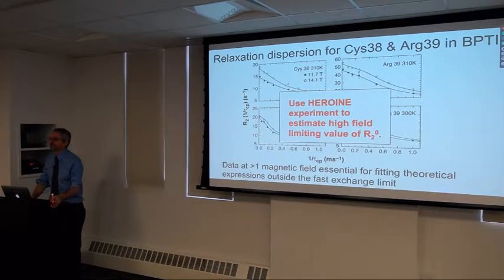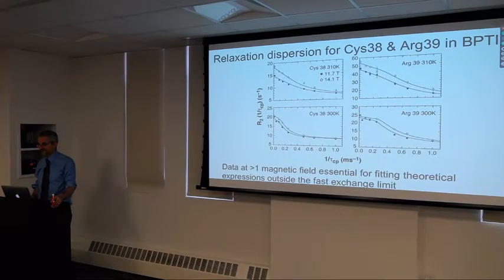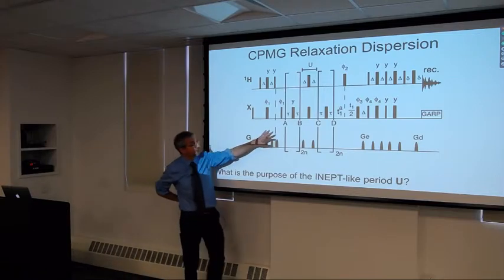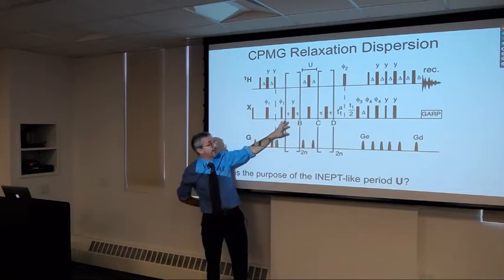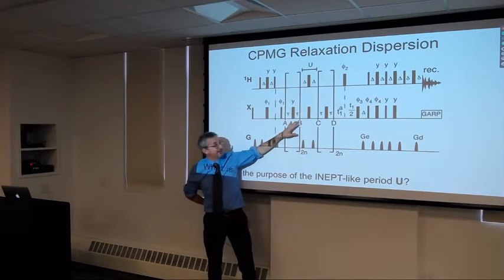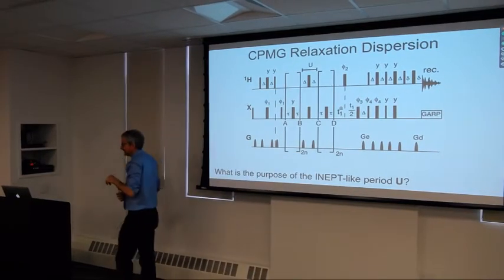Does that mean for very large protein, the T2 is only a few milliseconds, that would be hard to... That's right. So when you go to larger proteins, which we'll come to eventually here, we're going to want to do this experiment only on the TROSY line. So that rather than having in-phase and antiphase magnetization through here, we're only going to want to have the narrow TROSY line and then do TROSY detection. And that then gets one to larger proteins.